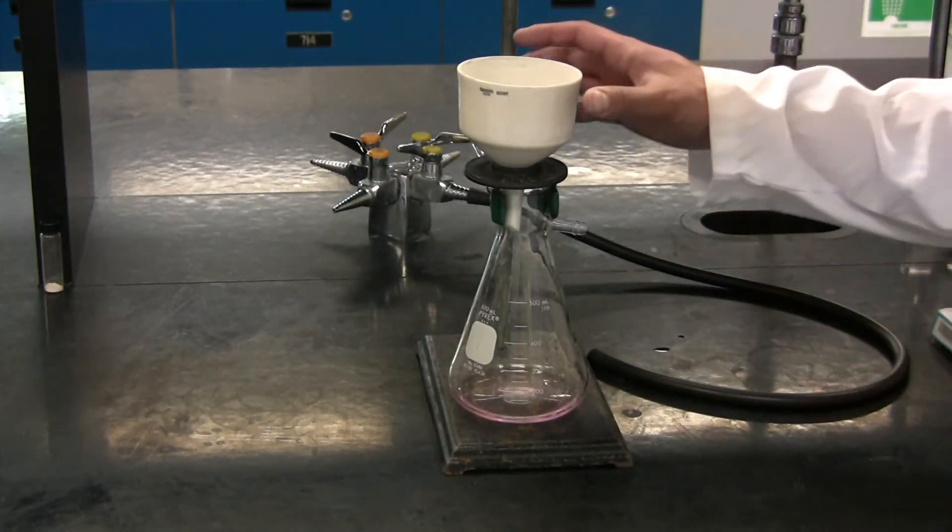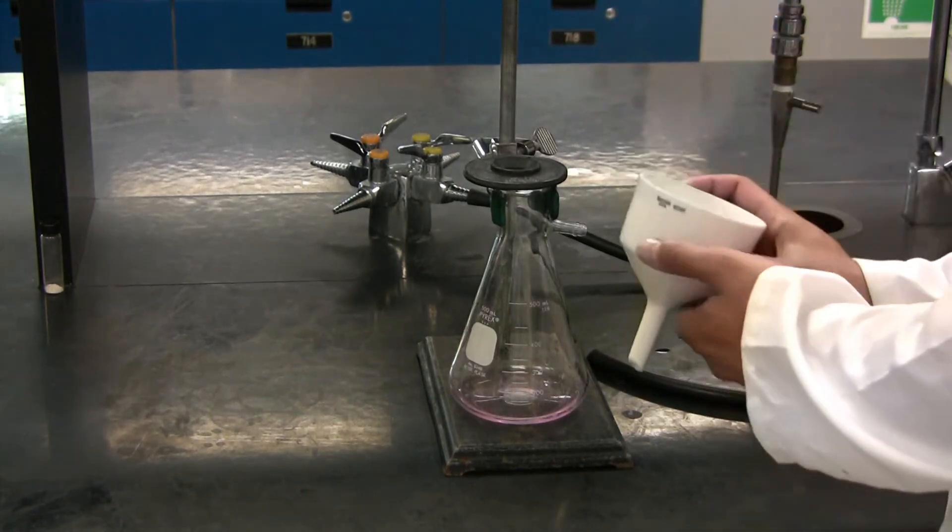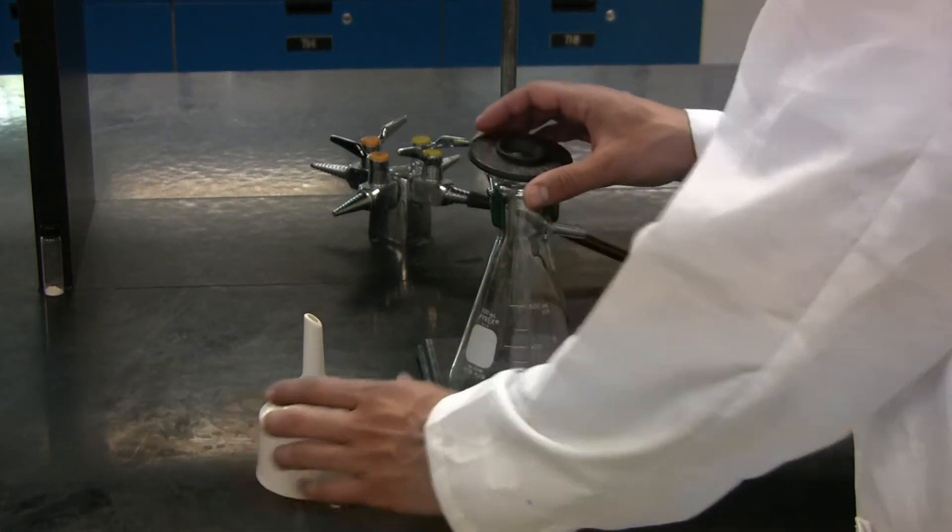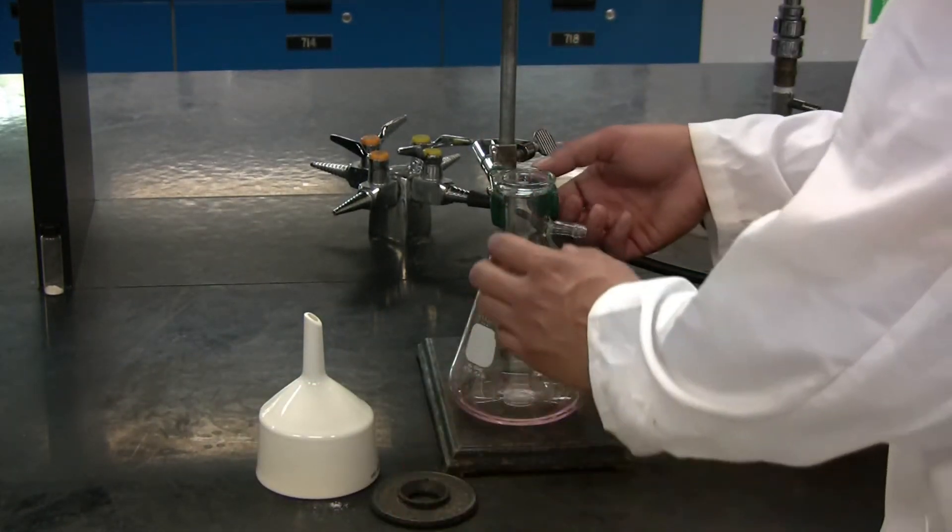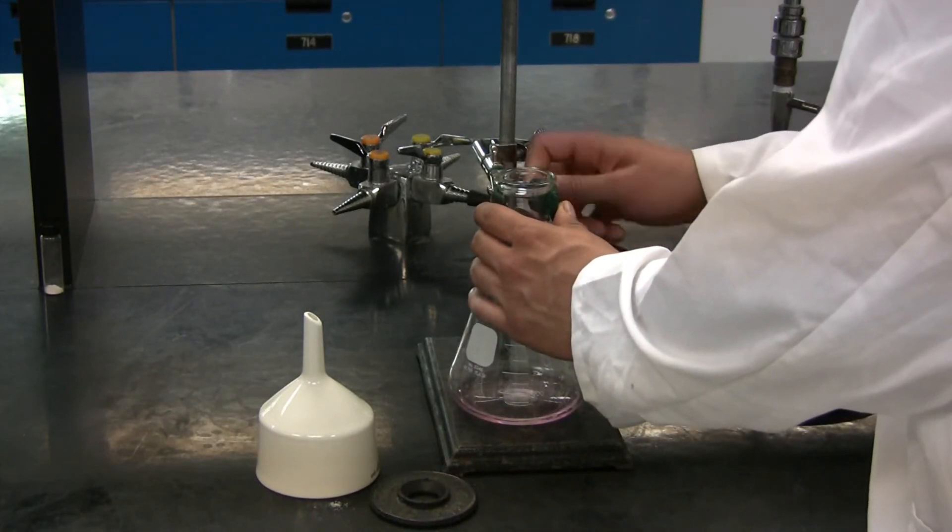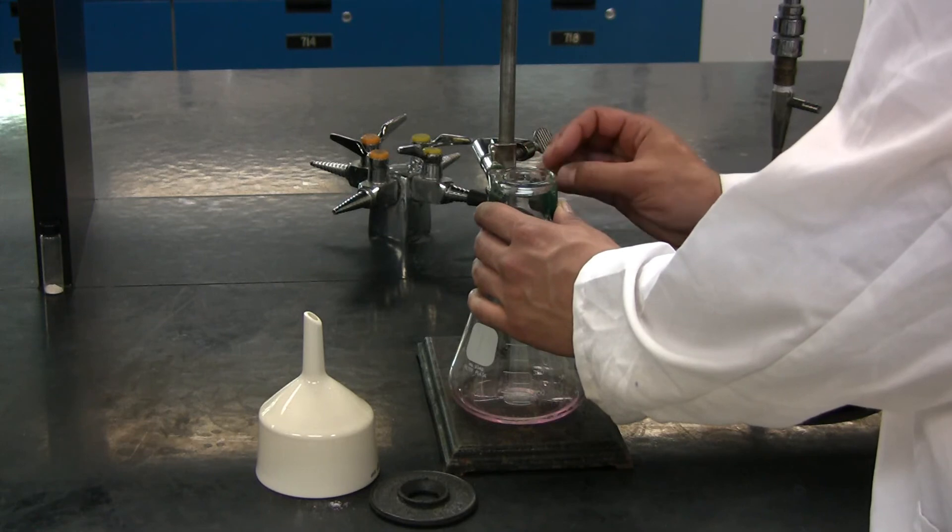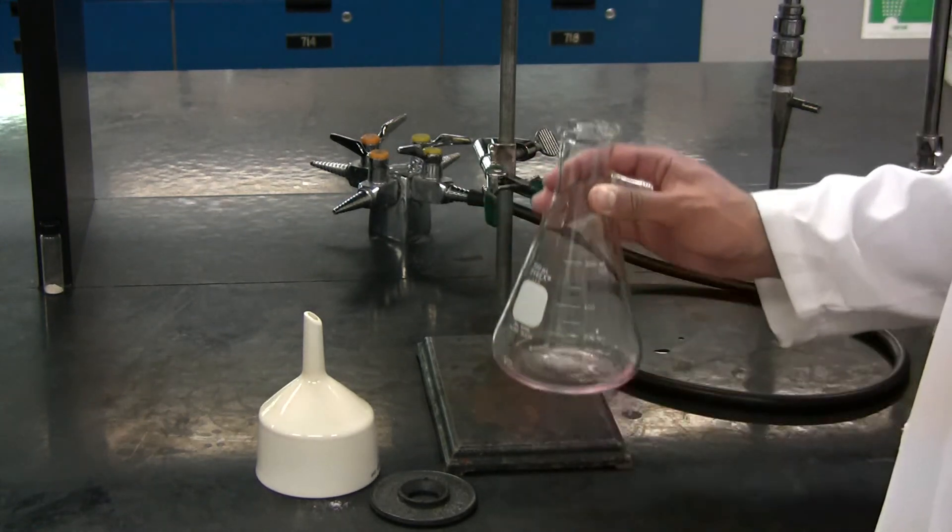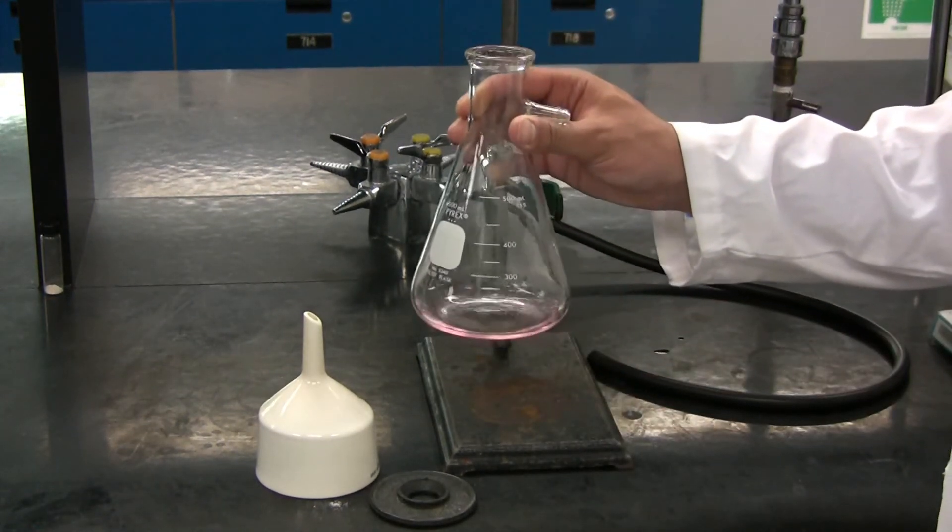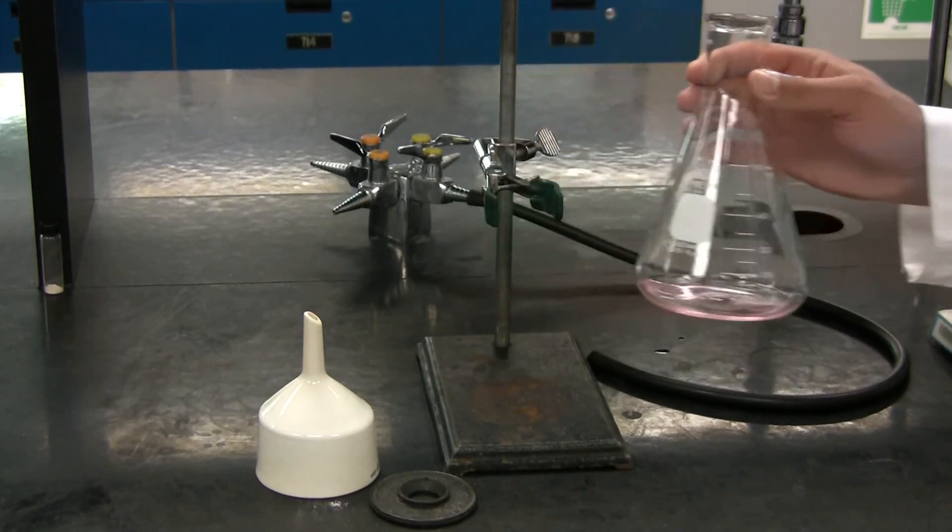You can disassemble the Buchner funnel and remove the rubber seal. Unscrew the clamp that holds the vacuum Erlenmeyer flask in place and remove this. You must appropriately discard this waste into the proper receptacle.